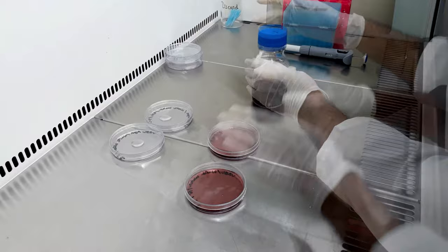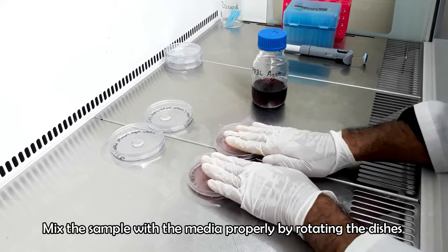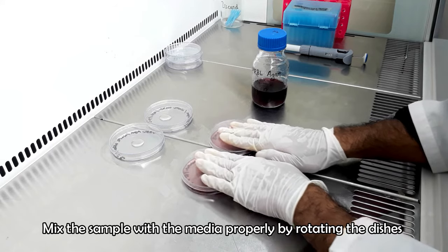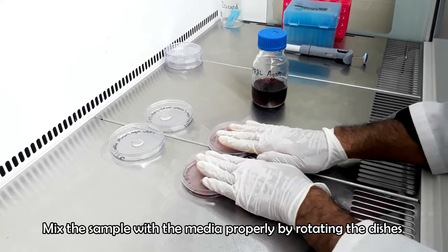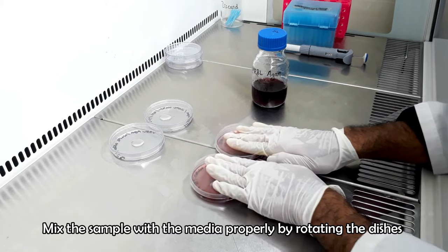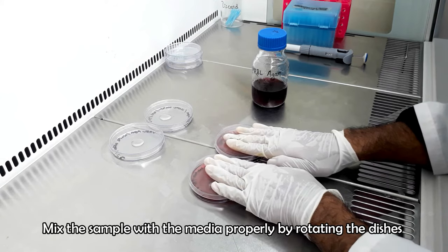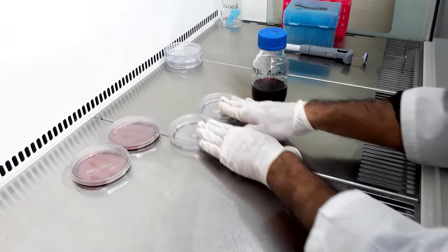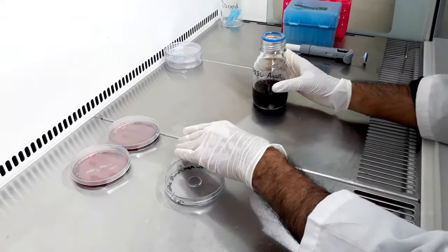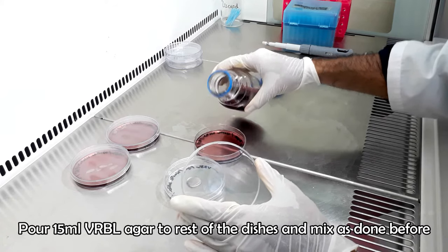Close the lids immediately and rotate the dishes clockwise and anticlockwise, up and down, to mix the media with the sample properly. In the same way, pour the VRBL agar media in both plates containing original sample and rotate them as done previously.